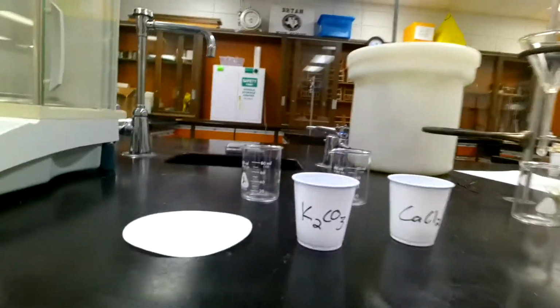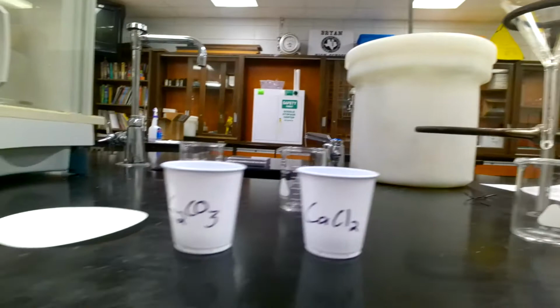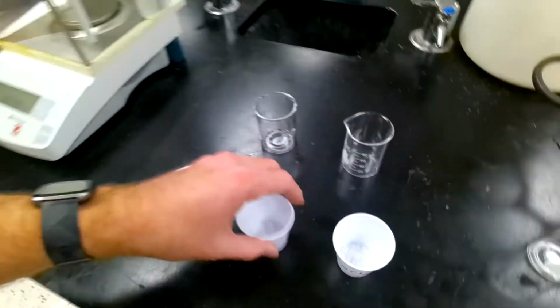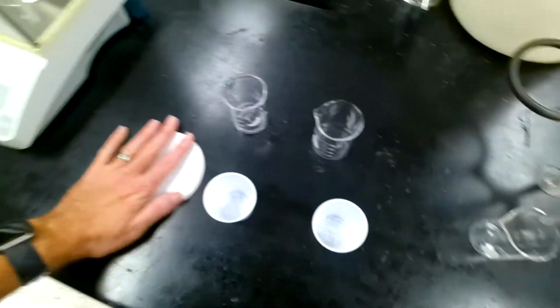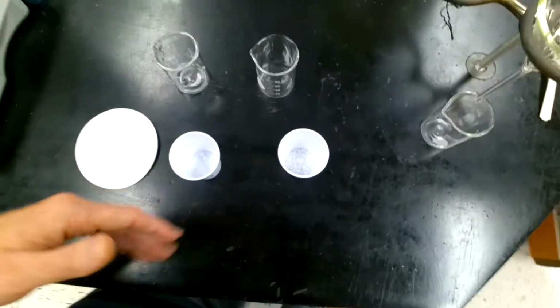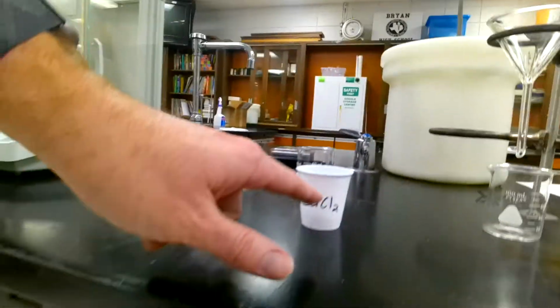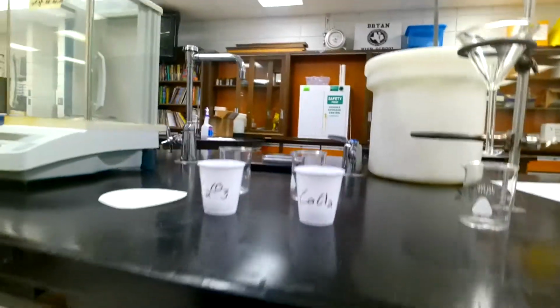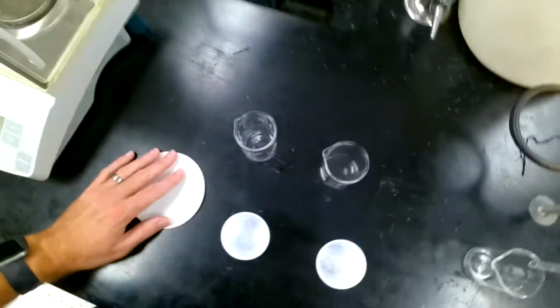So this is the general setup that we've got here. We've got our calcium carbonate, potassium carbonate and calcium chloride already set up. I'm not going to tell you the weights because everybody should be able to calculate the weights. I will tell you that calcium chloride was my limiting reactant this time. So just an FYI.